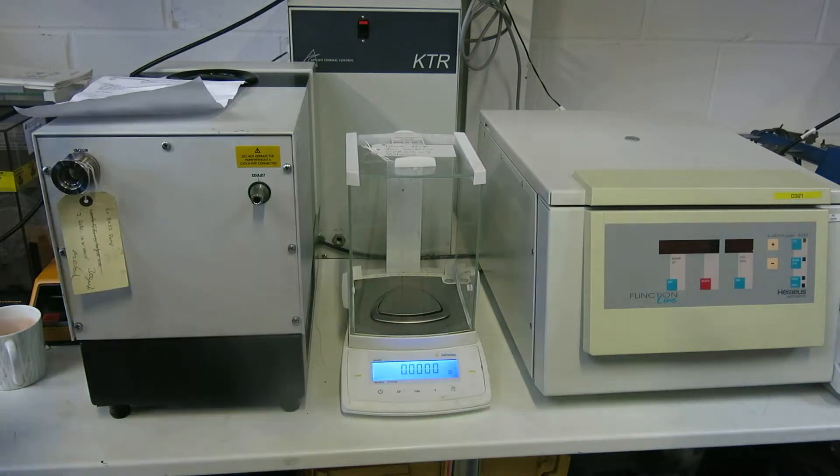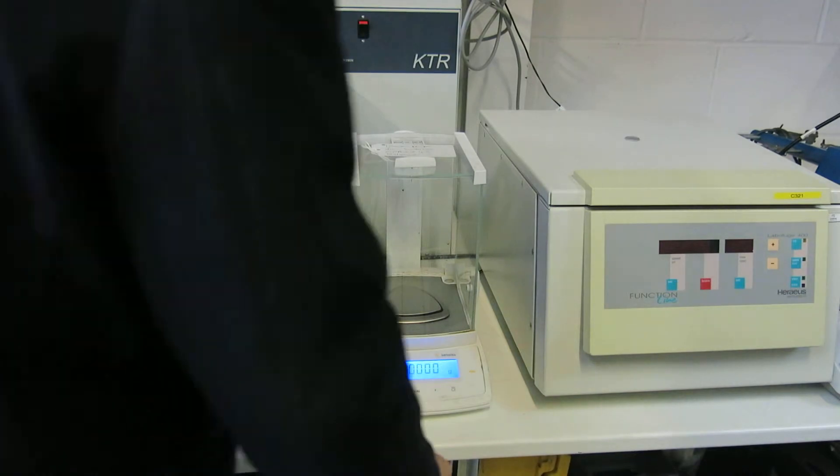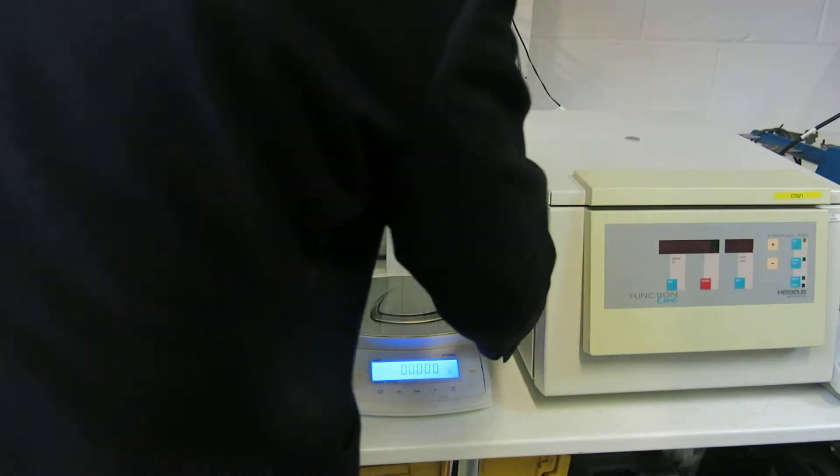This is the Sartorius CPA 224S, 0.1 of a milligram, maximum of 220 grams.